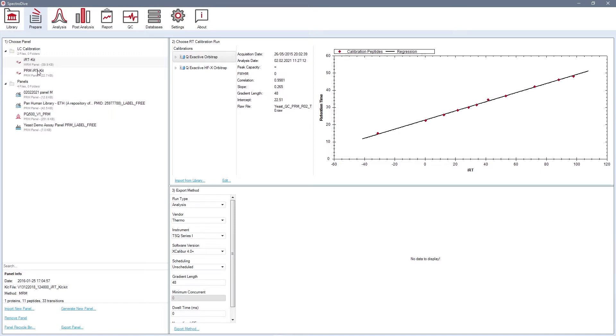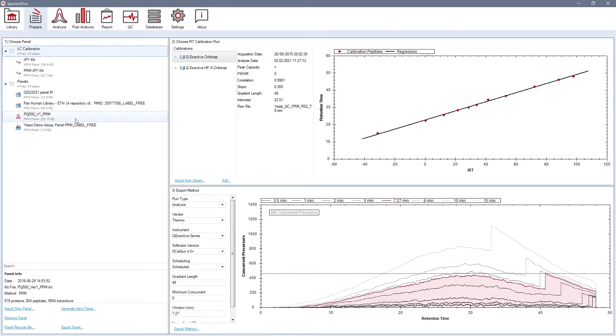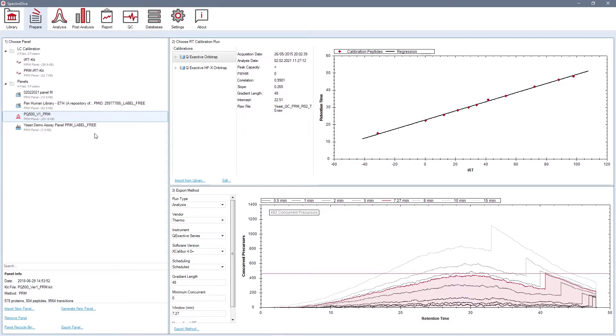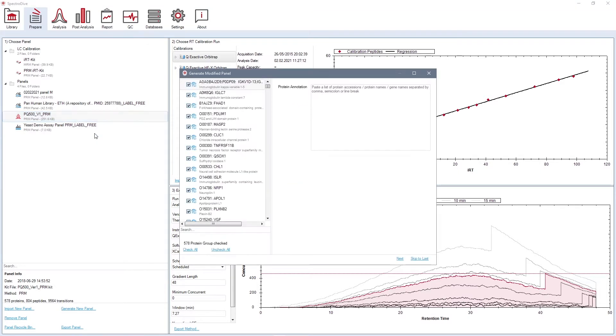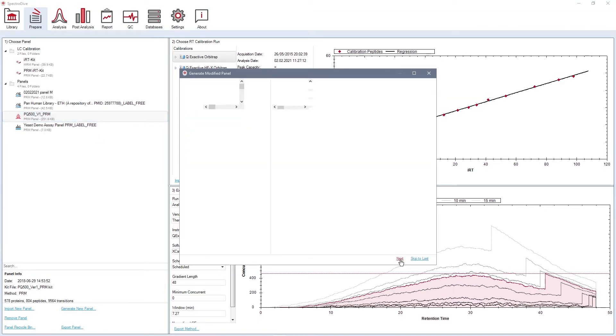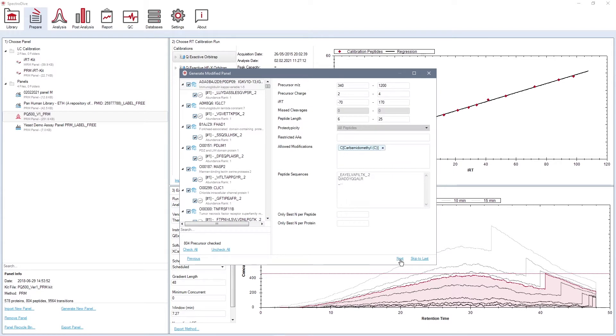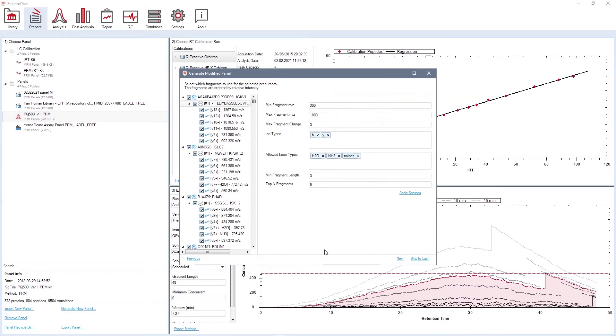A ready-to-use PQ500 PRM panel is a part of the kit. Using the option Generate Modified Panel, you can manually select only a subset of proteins and peptides of interest, as well as define the best fragmentation ions for them. Similar options are available while generating the panel from a library.